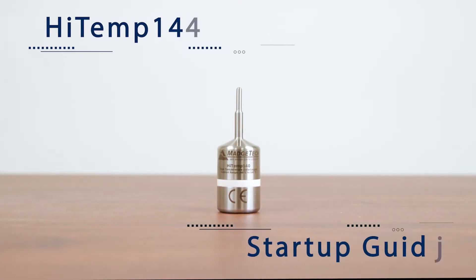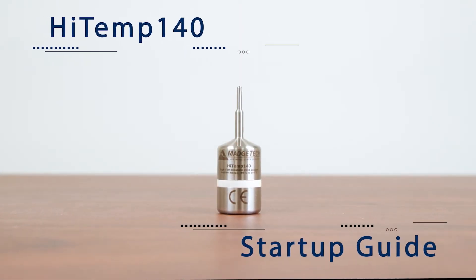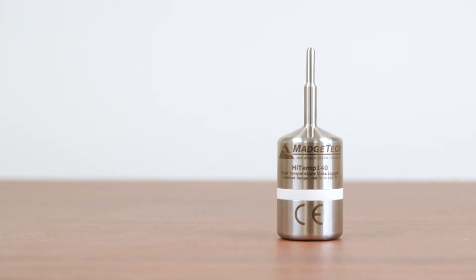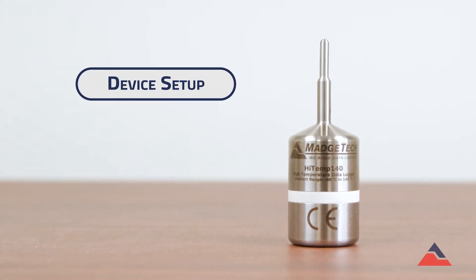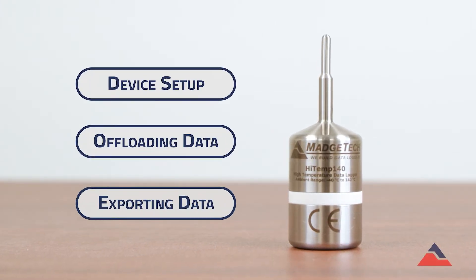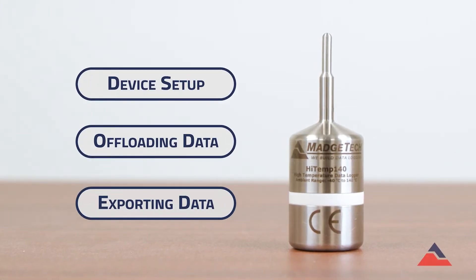Welcome to the HITEMP 140 Startup Guide. In this video, we'll discuss the initial setup, as well as how to offload and export data after your study.